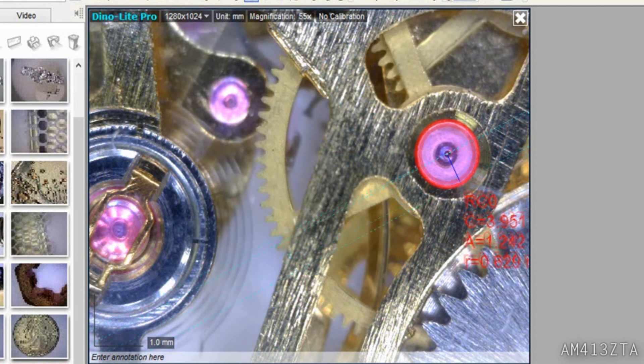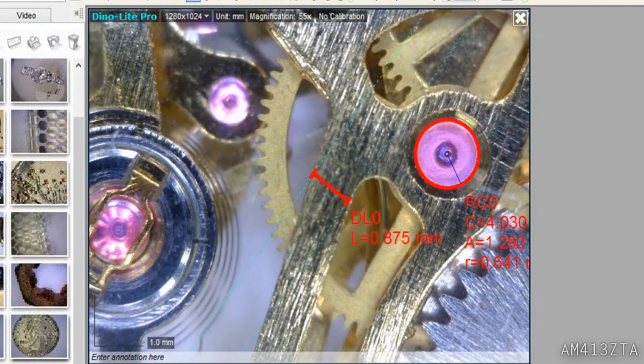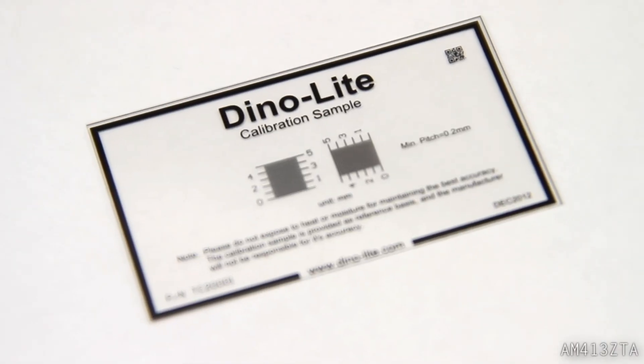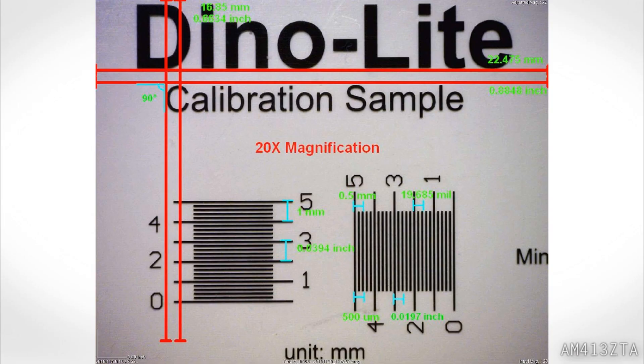Using the included software also allows you to perform measurements easily and accurately. Calibrate your measurements with the included 5mm calibration sample slide.